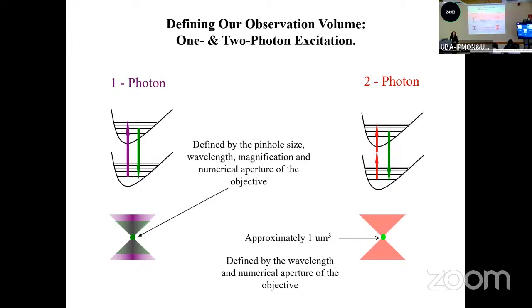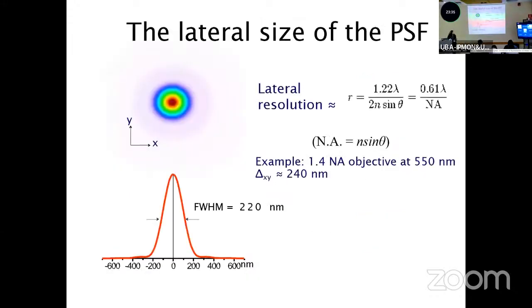So if we increase the laser beam, it's not linear, right? When my molecule emits light, it's not going to be linear intensity. So if I double the intensity, it's not going to double my light. The laser light is not going to double the intensity of the fluorophore. It's non-linear. It's going to be a quadratic effect, so it goes to the square of the intensity. So just to note that.